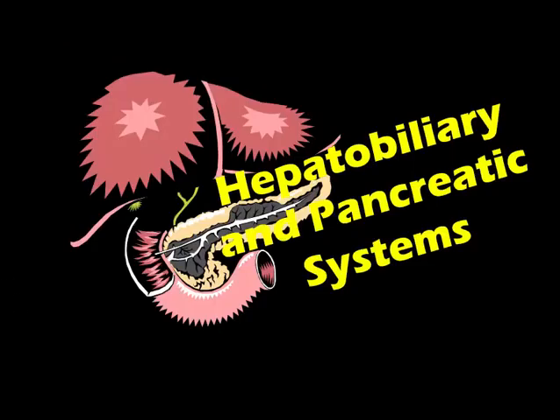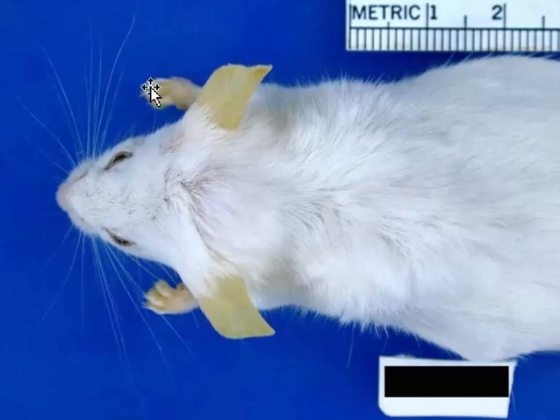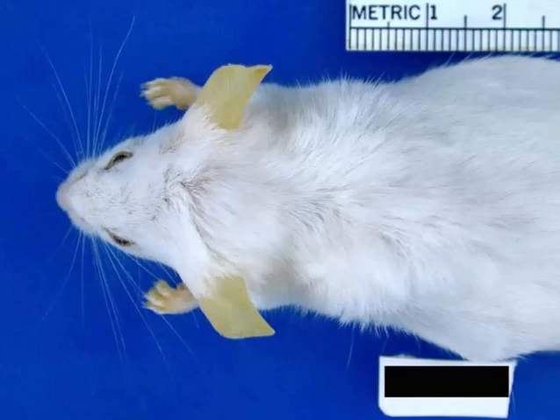Let's start with the liver and pancreas of the mouse. Here is a mouse who has icterus. You can see that the pinna and the feet are yellow, the nose is yellow. We probably have to first think about what could cause icterus — we could either be dealing with severe hepatobiliary disease or with severe hemolysis.